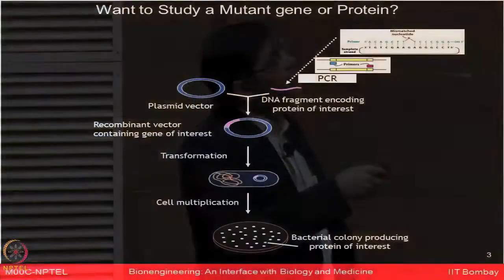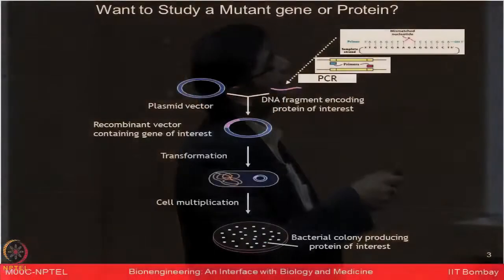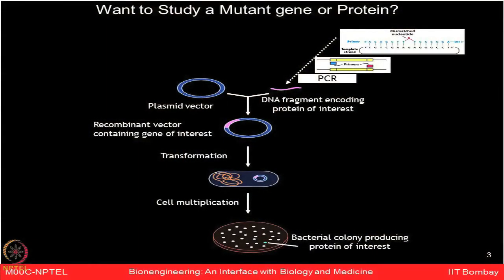To do that, ideally you are making the changes in the gene sequence itself, right? And to introduce that gene sequence change, you can actually introduce it at the primer designing level itself. When you're designing the primer, you are selecting a short nucleotide stretch. If you make some changes in the primer sequence itself, that can make changes subsequently in the gene and then in your cloning procedure.